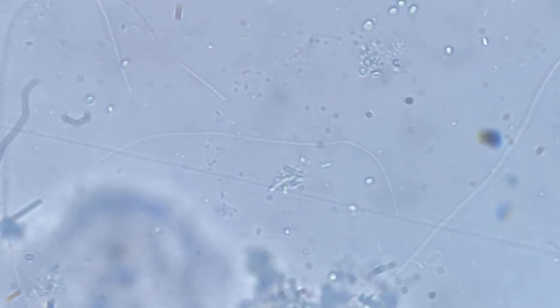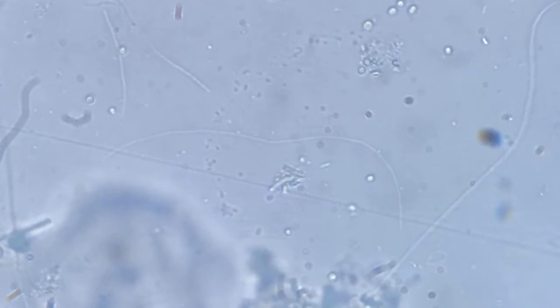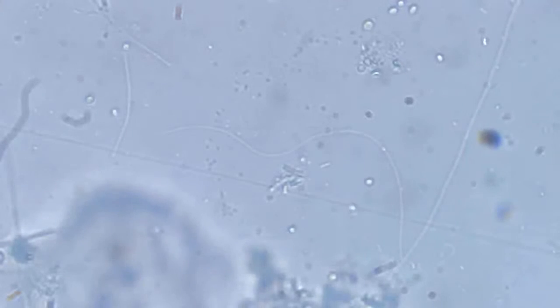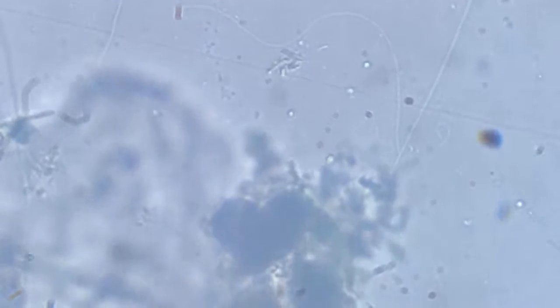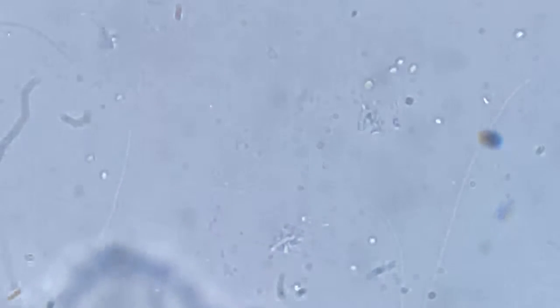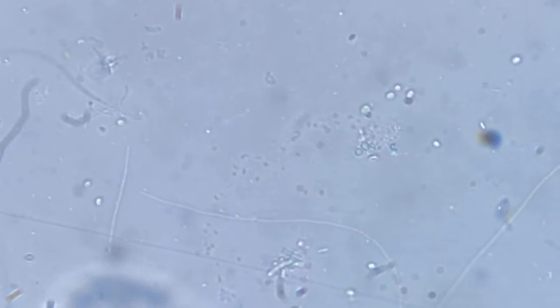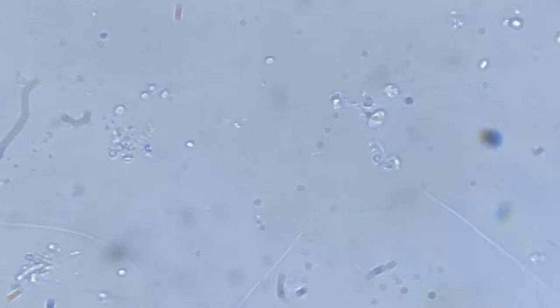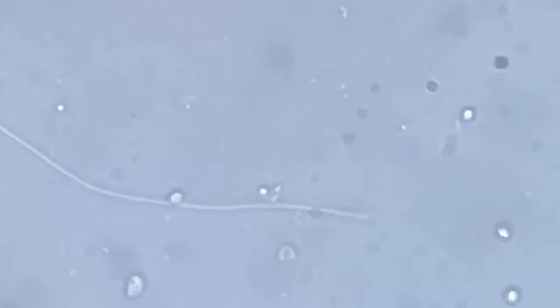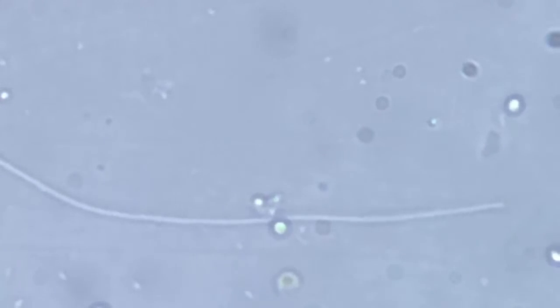And just as it has crossed, there is another one running almost horizontal and now going towards a dip. And where it is going, there is a bigger one again. So there are quite a few of them in this little droplet of water which I had collected from a cow shed. This one is still larger than the previous one. Maybe we can try to focus on its head. See, there is no specific differentiation of the head part either.